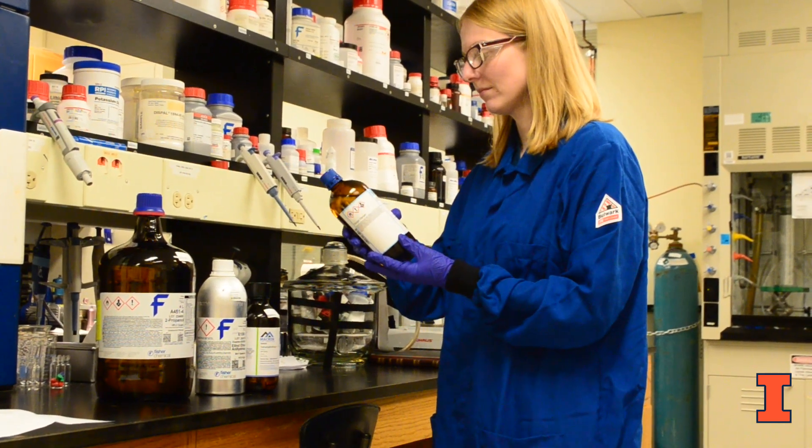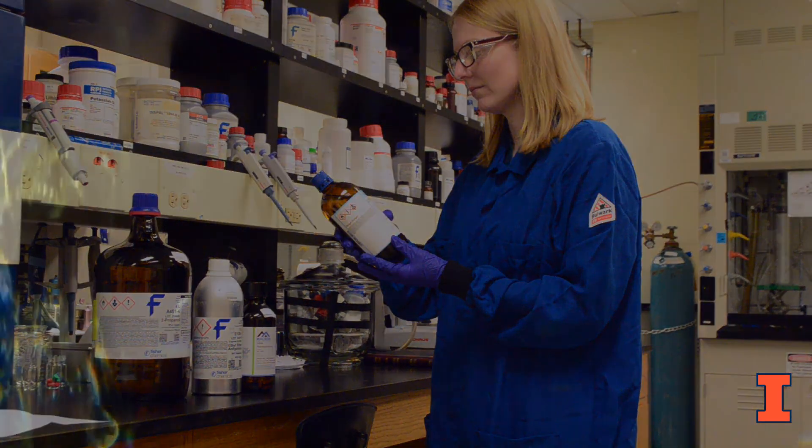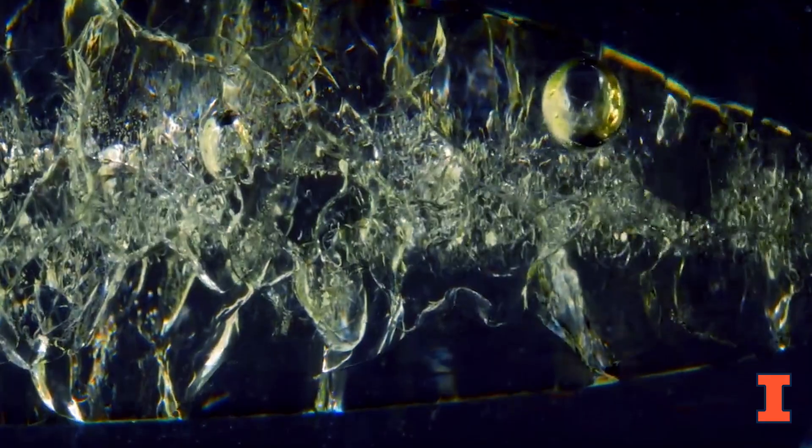Peroxide forming chemicals are a class of compounds that can form shock sensitive explosive peroxide crystals over time when exposed to light and air. Keeping track and testing your peroxide formers should be a part of your chemical management plan.